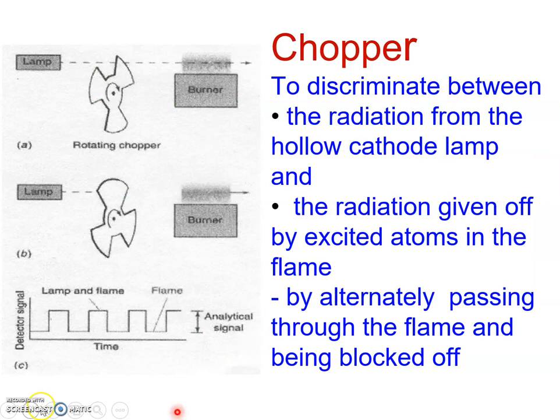Hopefully, this slide will explain better how source modulation is performed and how we get the analytical signal.